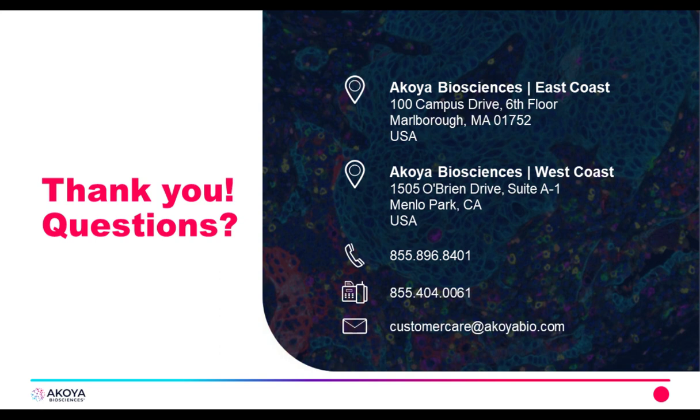Thank you. And I'm going to stick with you, Dr. Carlson. You just showed a list of mouse and human antibodies compatible with CODEX. Is this the same list of antibodies that are commercially available and most up to date? And is there a shareable list of community antibodies? So that list includes a subset of antibodies that are available as validated antibodies from Akoya, and we know that those antibodies work with CODEX. I'm happy to share any antibody lists with customers offline.